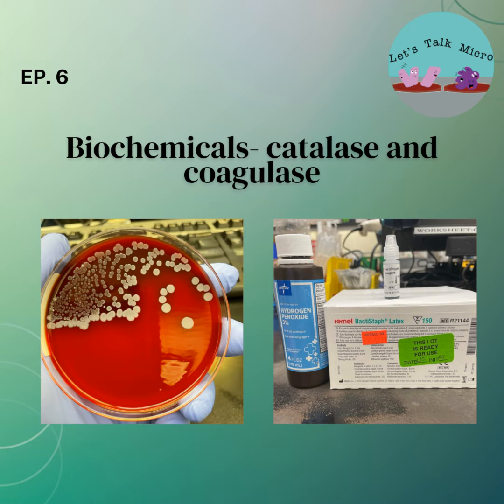You can also appreciate that when you put it on motility agar, you see the nice shape of the umbrella. You stab the agar, you get a colony, and then with the needle you stab it, go down, then bring it up, staying in the same line of inoculation. And normally for motility, if the bacteria grows outside that line, it's motile. And in the case of listeria, you see the shape of an umbrella.